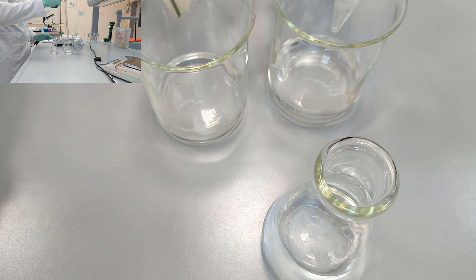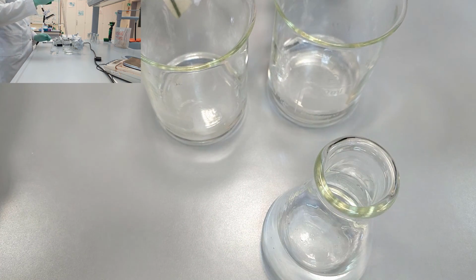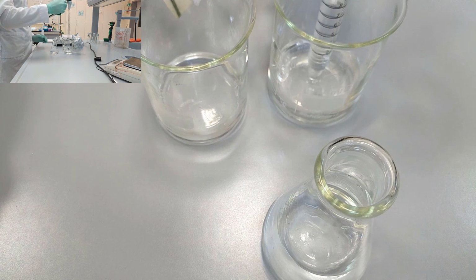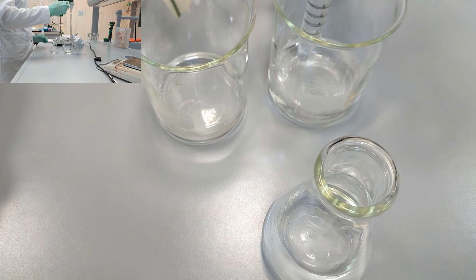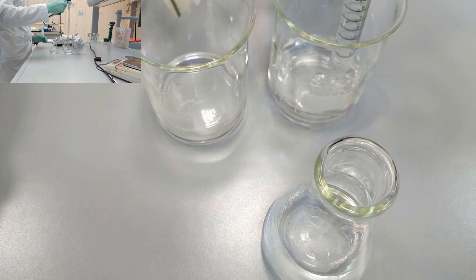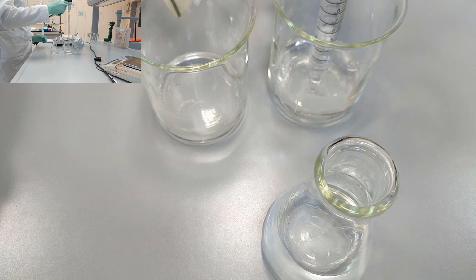We will need to further mix these new solutions. For the 0.8 we are going to use the magnetic stirrer, and for 0.4 molar concentration we are going to use the pipette gun. To do so, you are placing the tip of the pipette inside the solution and then pipette it up and down.